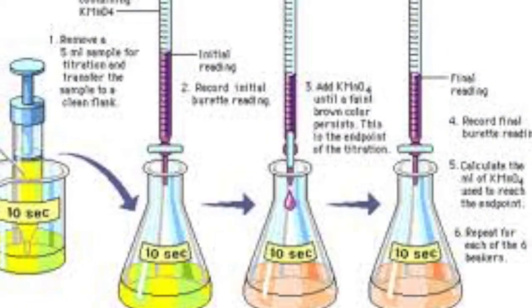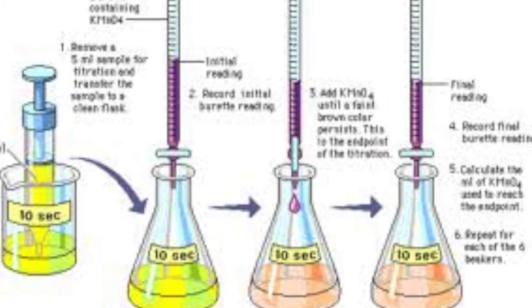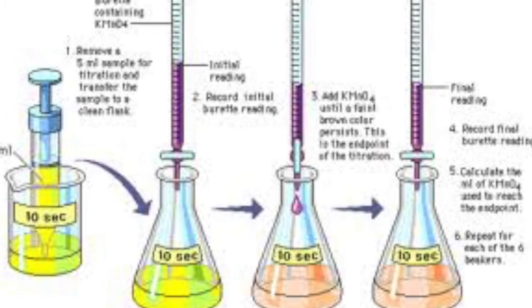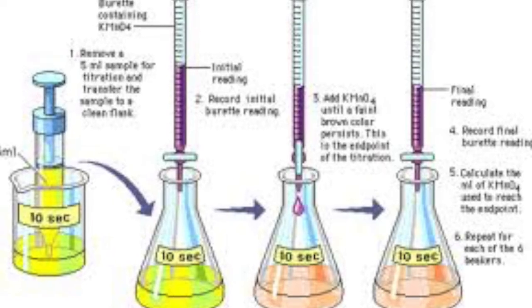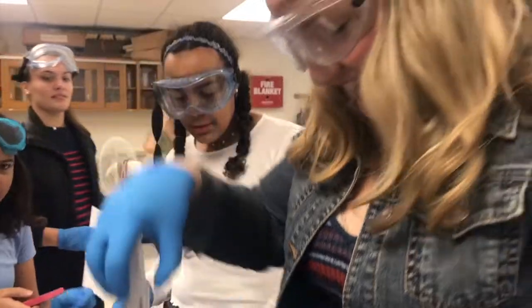To determine the amount of H2O2 initially present in our 1.5% solution, we need to perform all the steps of the procedure without adding catalase to the reaction mixture. This amount is known as the baseline. In any series of experiments, a baseline should be established first. This is what we did in Part B.